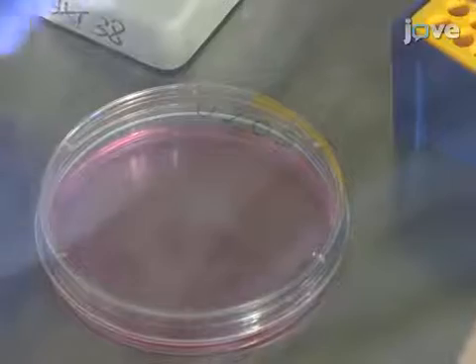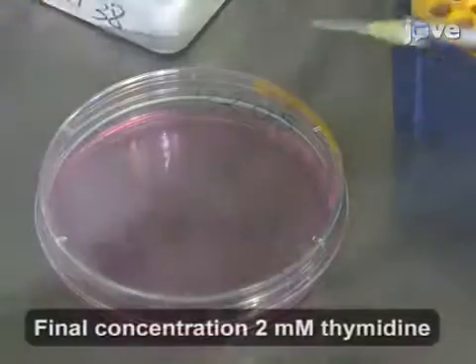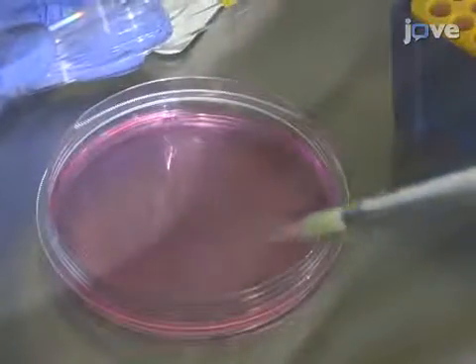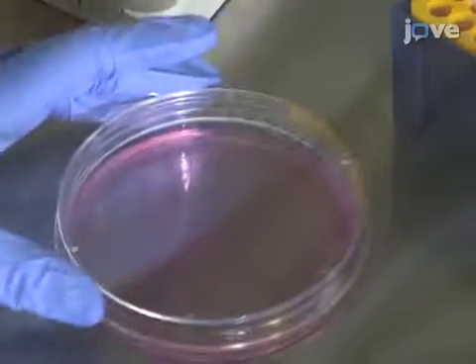For the thymidine block, add 100 microliters of a freshly prepared 200 mM thymidine stock to each 100 mm culture dish. Incubate the cells with thymidine at 37 degrees Celsius in a humidified atmosphere with 5% CO2 for 20 hours.